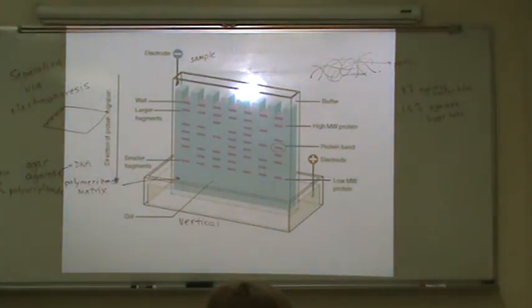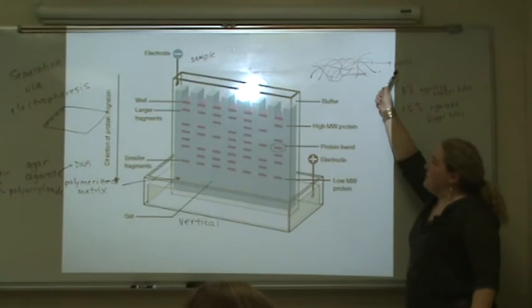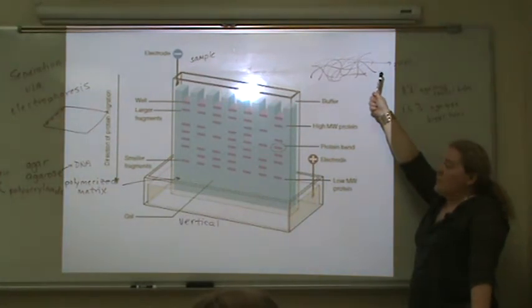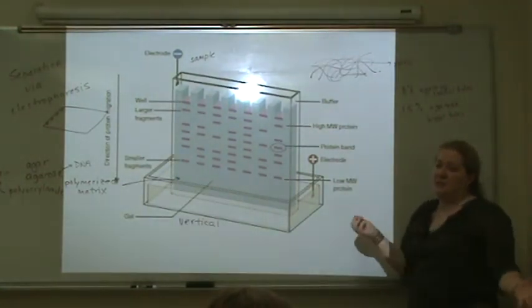He's from Hawaii. And I heard him one time describe to a student in the lab how this works, as if the mesh is a forest, and you and a friend are going to run through it, and one of you has a twig, and one of you has a lumber, which is more like a log.